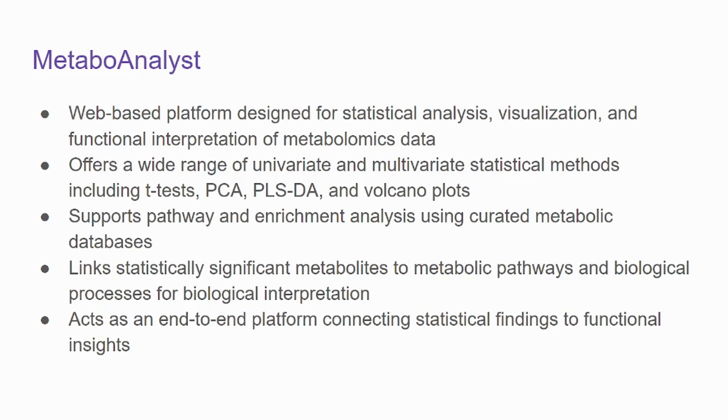It is mostly used by researchers. Okay, so it acts as an end-to-end platform. There are so many processes that we can do inside it, from statistical findings to functional insight. We can do pathway analysis in it. So there are so many things that can be done.